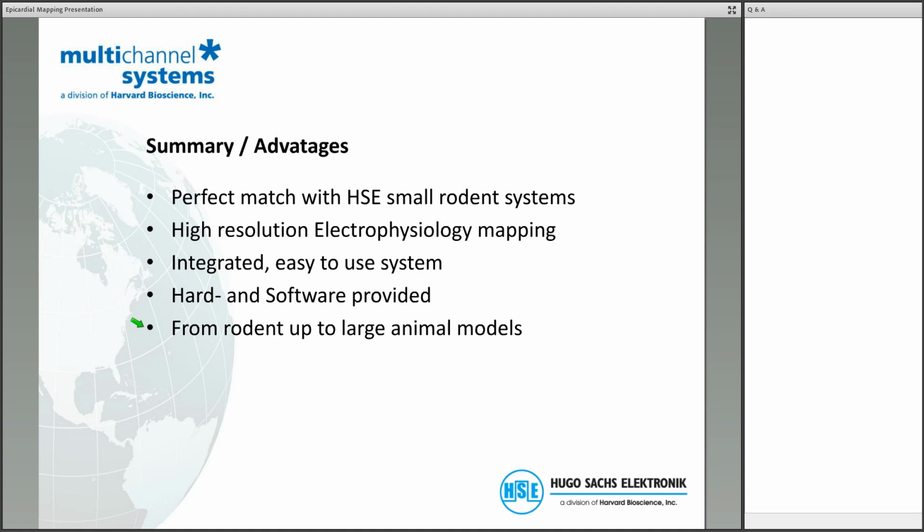Okay. And would you also stimulate via this Plex MEA? Is it possible to electrically stimulate? Depends. Technically, definitely. We can connect a stimulation adapter. We can use any of the gold electrodes to deliver a stimulus. However, please imagine that we try to make our recording electrodes very, very small.